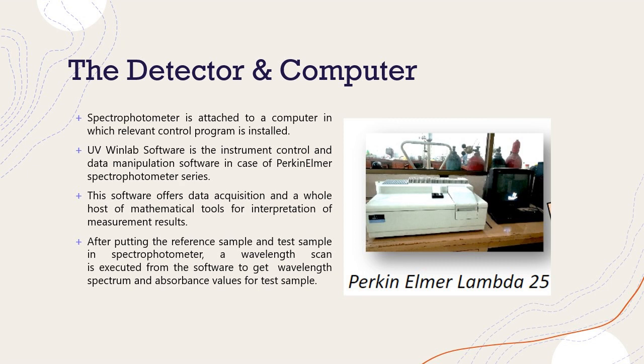The spectrophotometer is attached to a computer on which the relevant control program is installed. UV WinLab software is the instrument control and data manipulation software for the PerkinElmer spectrophotometer series. This software offers data acquisition and a whole host of mathematical tools for interpretation of measurement results.